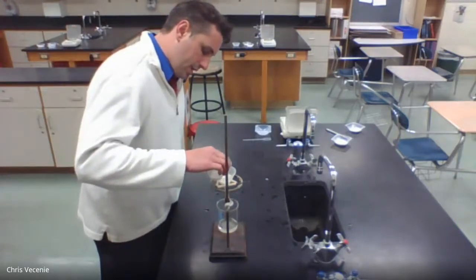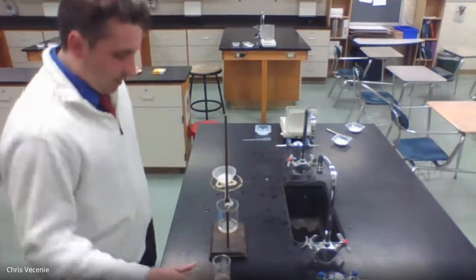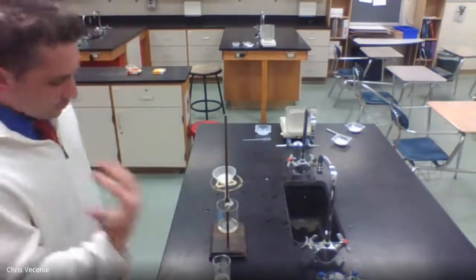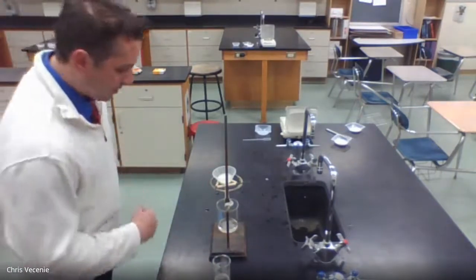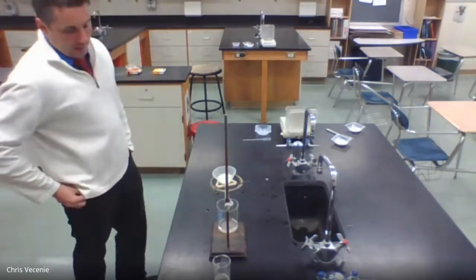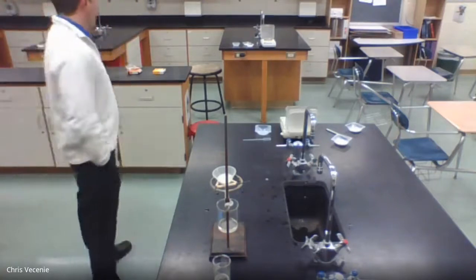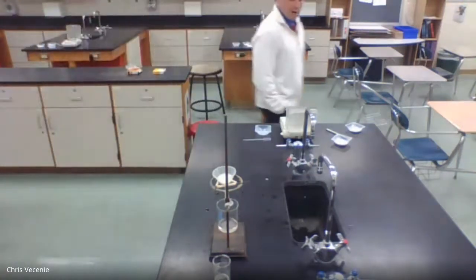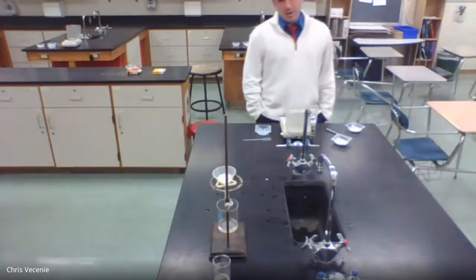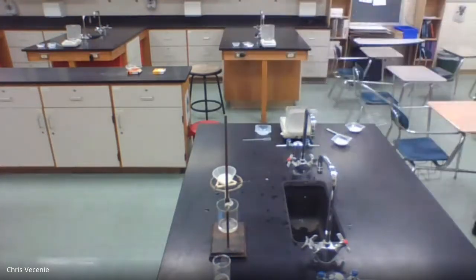One of the tips that I try to give is before you pour, give it a little swirl, and that helps it not stick to the glass as much. As you can see, we're chipping away. My liquid underneath is still clear and colorless, which is good, which means we haven't missed anything during the filtration process. Otherwise, it can be a bit of a pain. You'd have to pour all that liquid back up through to ensure you got your maximum yield.